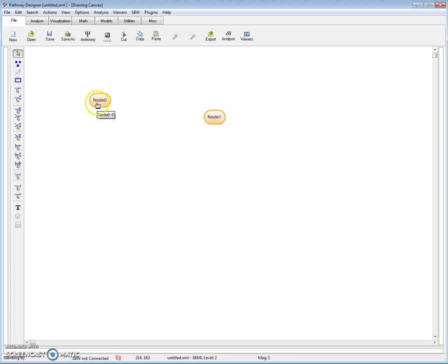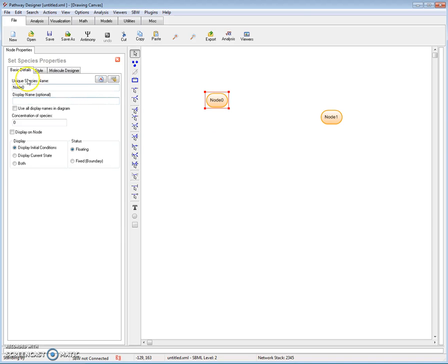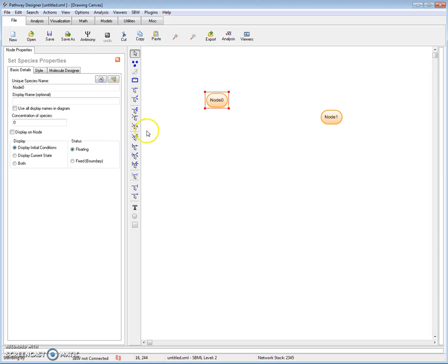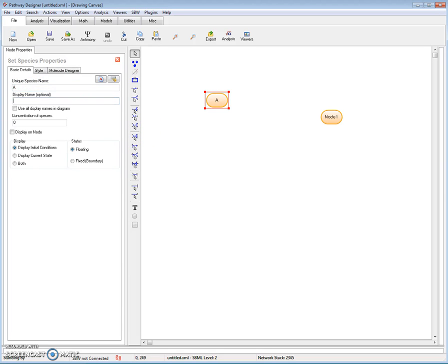If I double click on one of them, it will bring up the design panel. And here I can actually rename it to A. This is now node A.